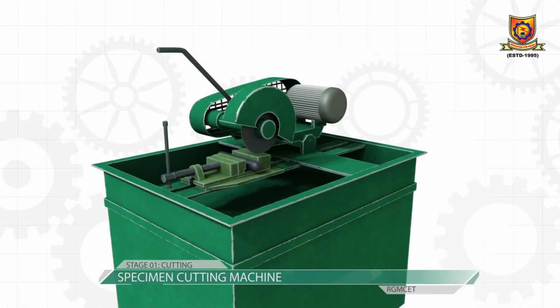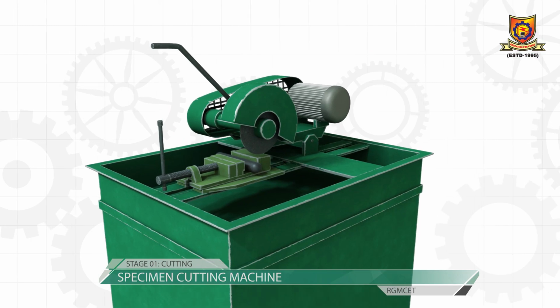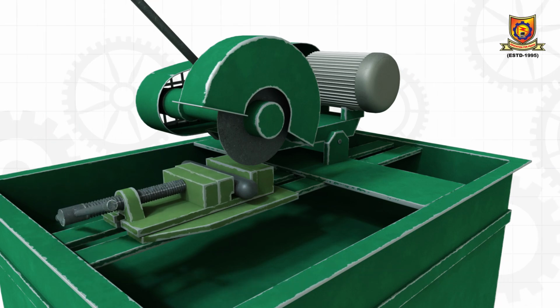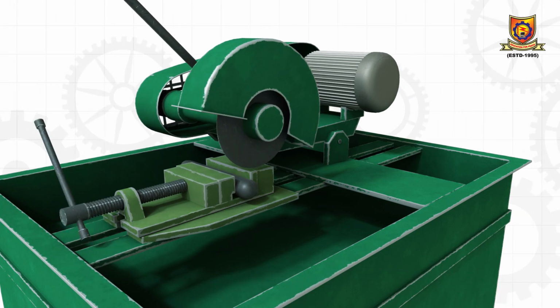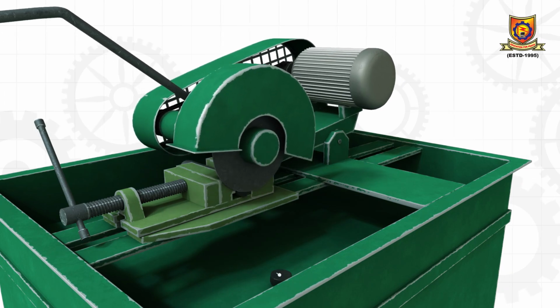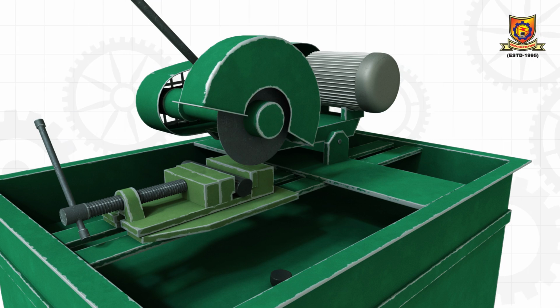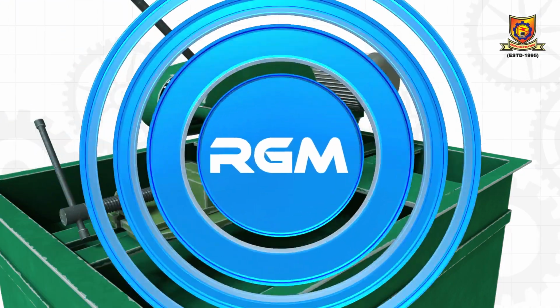So this is called a specimen cutting machine. So that huge material is placed in this machine and a small sample is cut out from that huge material. So this is sample collection, a sample collection from huge stock. So this sample consists of similar properties as that of its base material.